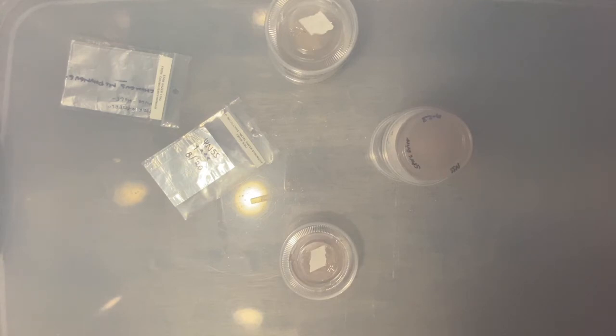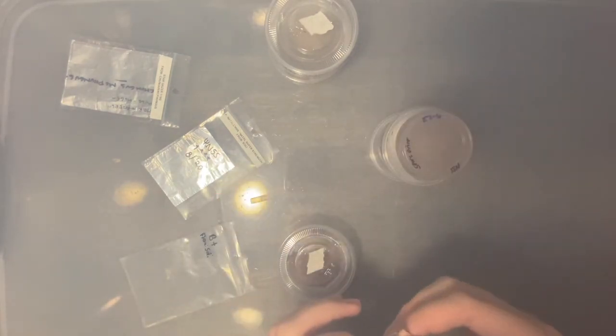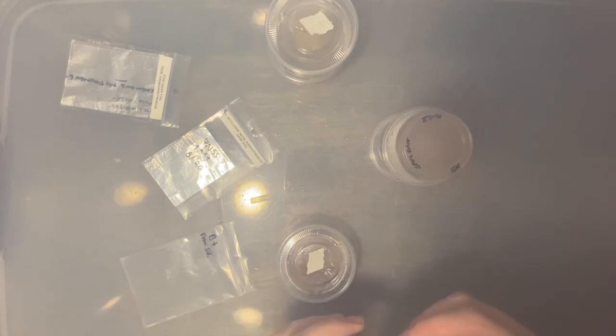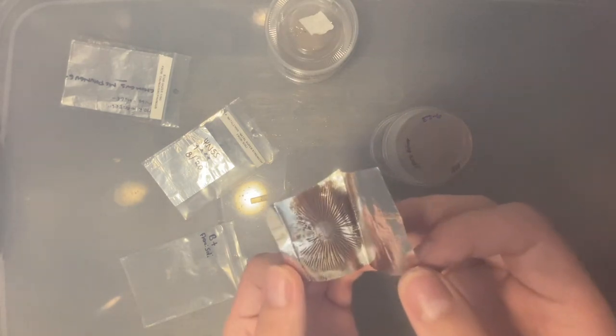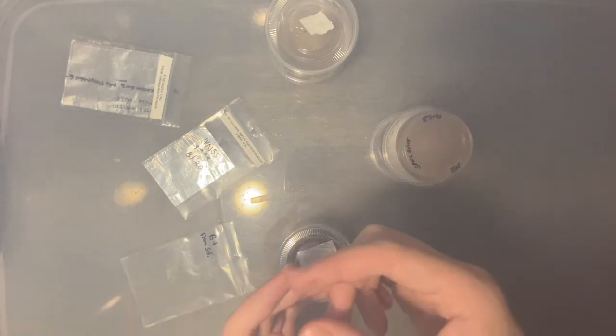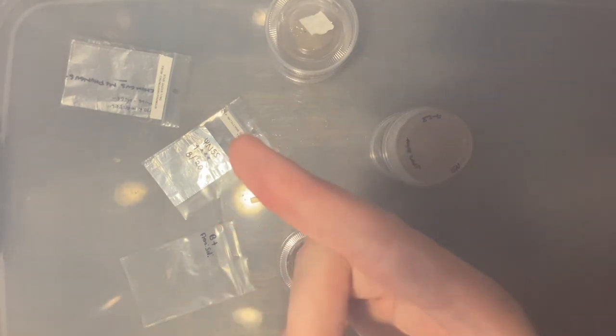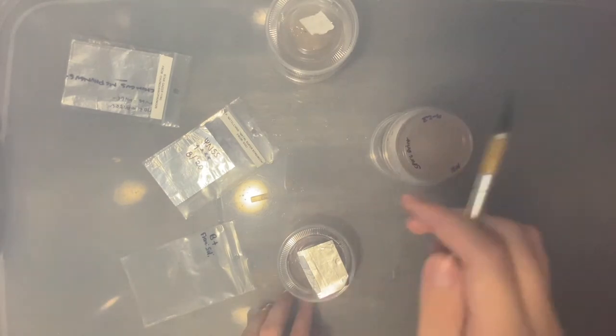So first things first, we're going to take our print out of the baggie. And now let's take a look at this print. This is from my friend in the Netherlands. He included it as a freebie. Oh yeah, that's a nice thick little print. I like it. And now I just noticed there's either some Sharpie or some spore print on my fingers, so I'm going to wipe my fingers and spray some alcohol on them again.